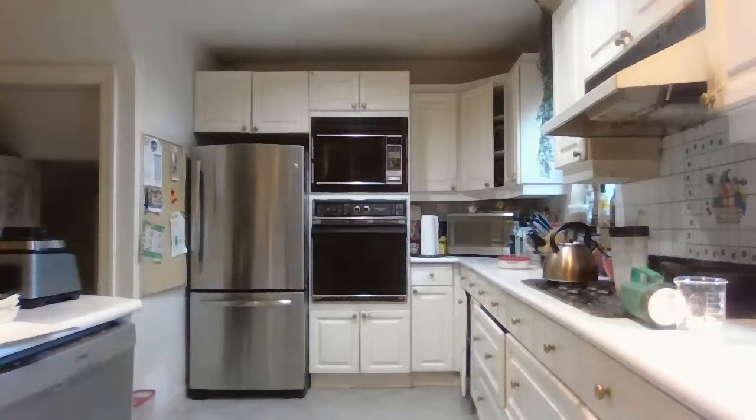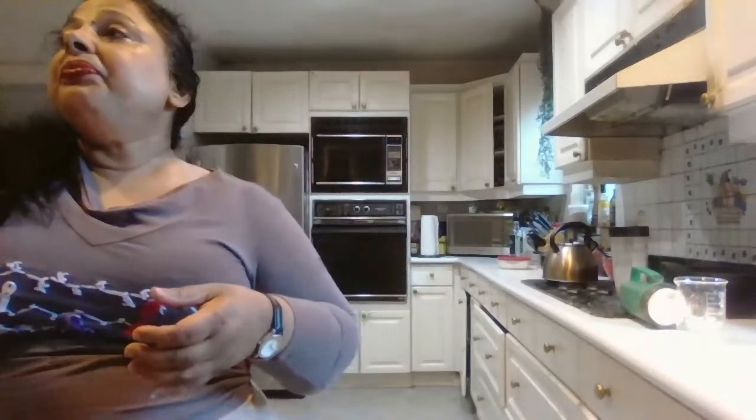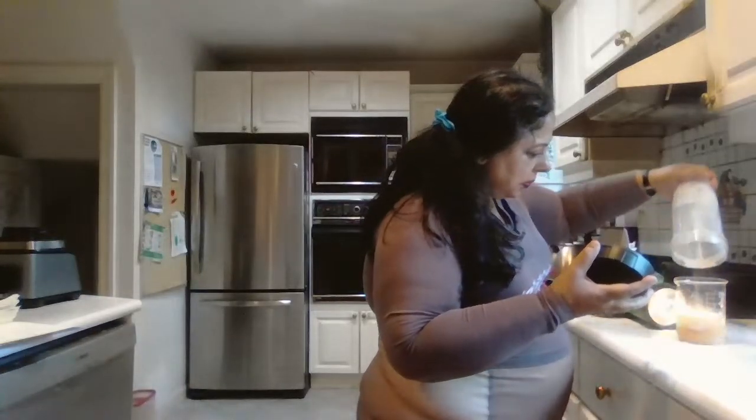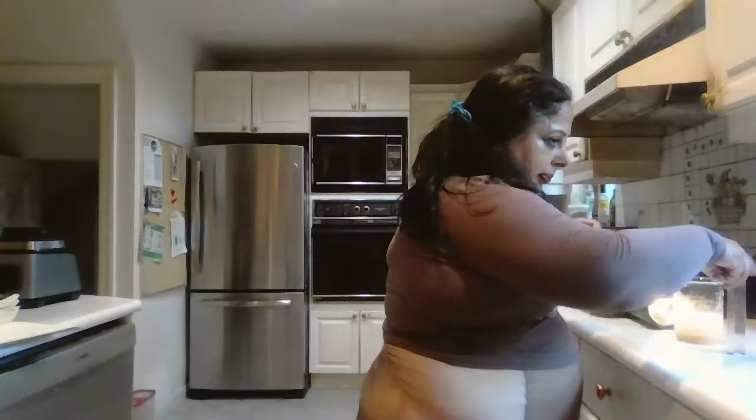Oats is the best, but you have to use more of it, because it's less dense. So 200 ml here. Otherwise I have to do the calibration curve.